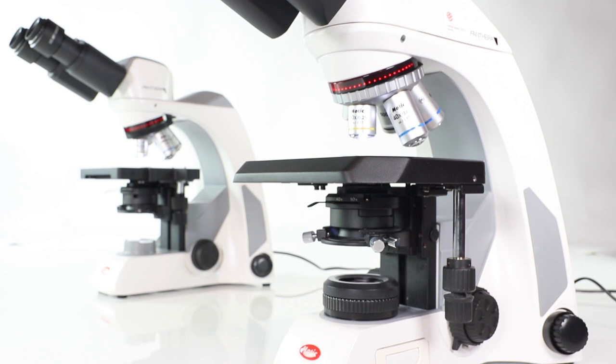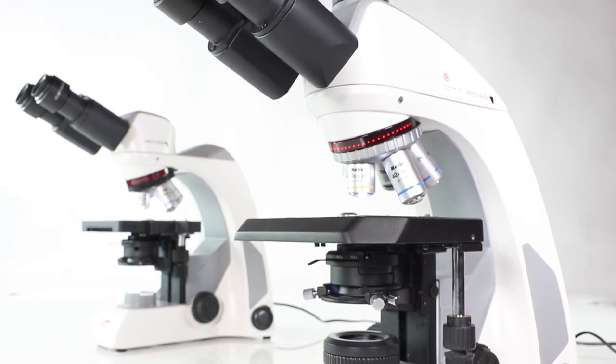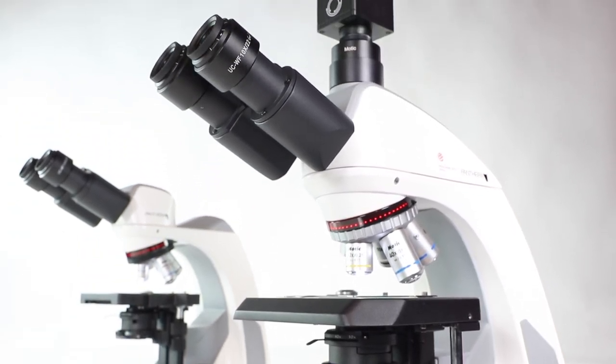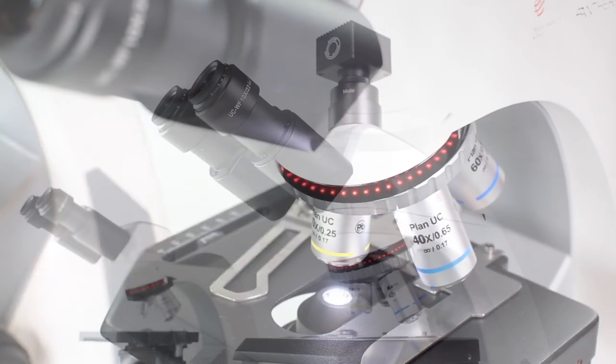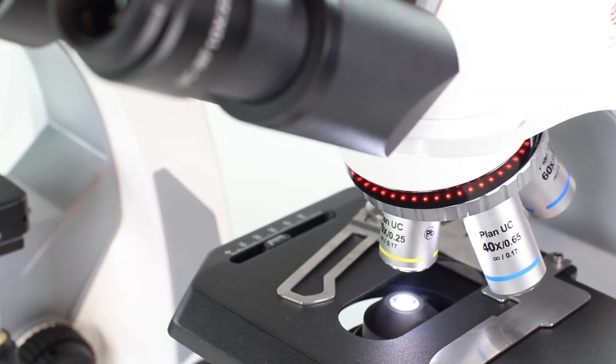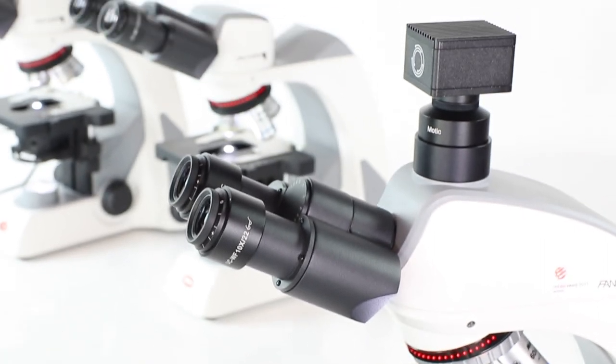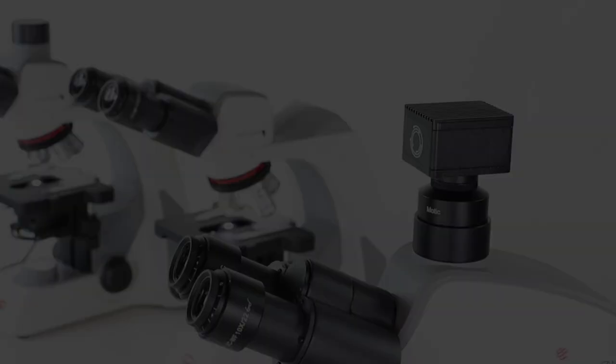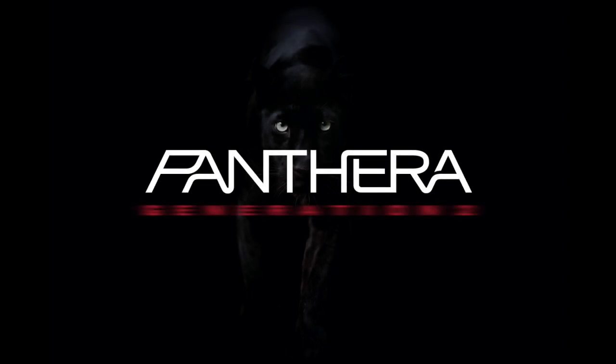We may not have reinvented the microscope, but we lifted its performance to a world-class level. Your vision is our mission. Explore the next generation of Panthera.